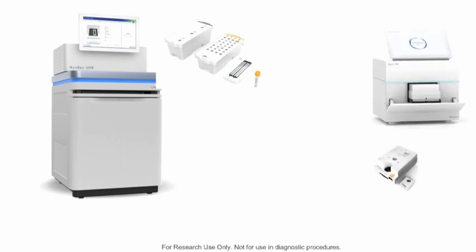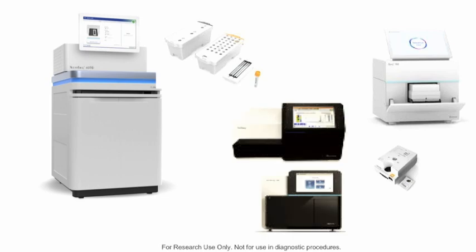And so we have that, plus iSeq, which we use primarily for QC for this platform, and I'll mention that in a little bit of detail. And then what turns out to be a very good balance to round out the output capabilities is NextSeq and MiSeq. So 2 of each of those, and then 10 NovaSeqs is what the platforms look like overall.